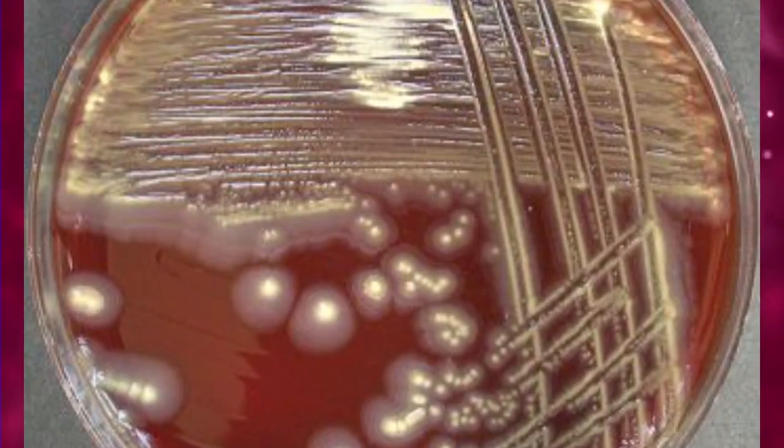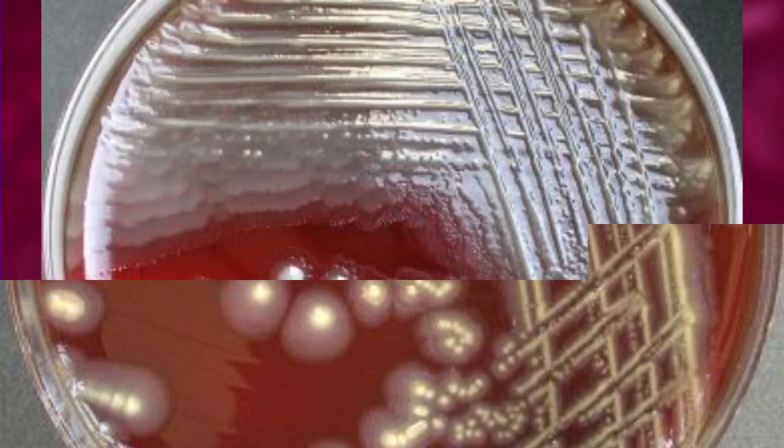Proteus grows well on a variety of routine media, such as MacConkey agar and blood agar.